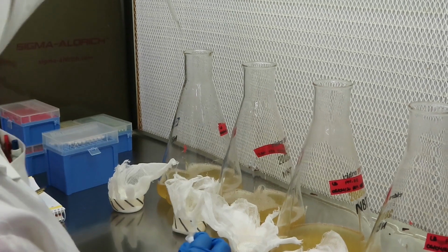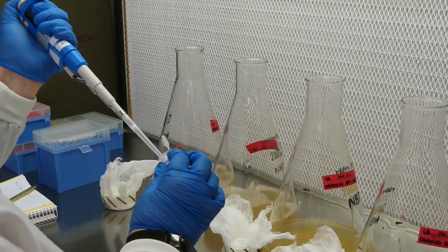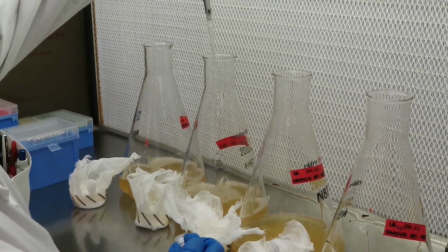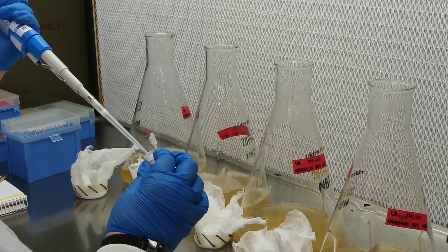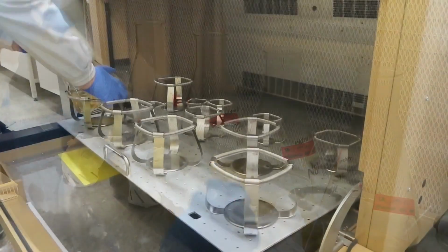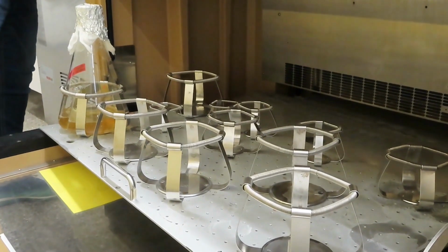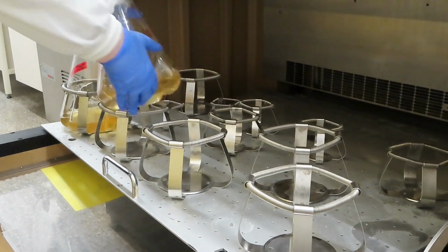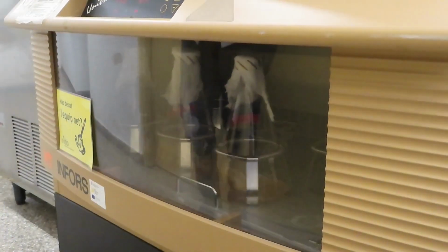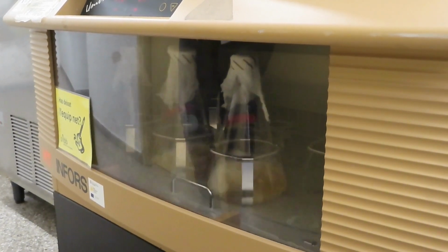For non-constitutive expression systems, an inducer must be added to the medium to induce the protein expression. In this case, because the transgene is under the control of the LAC operator, we use IPTG as an inducer at 1 millimolar final concentration. Then, the flasks are incubated at the appropriate temperature and time to favor the best protein expression, normally desired in high amounts in a soluble form. In this case, the cells are incubated overnight at 16 Celsius degrees.